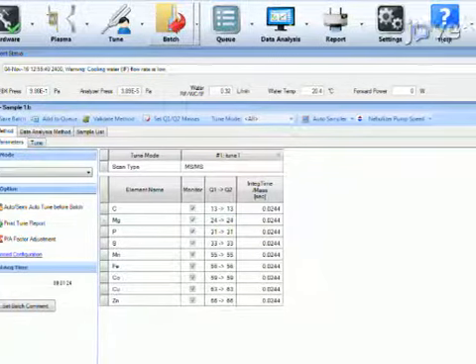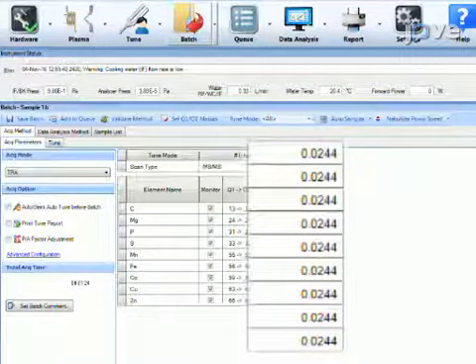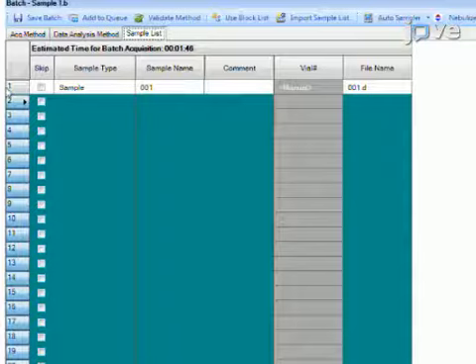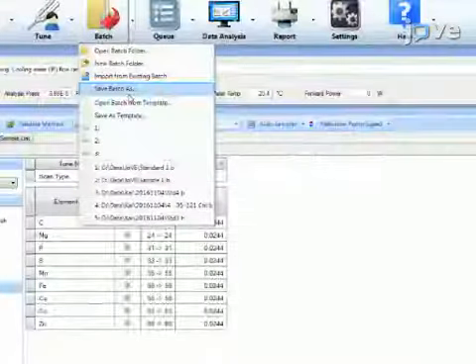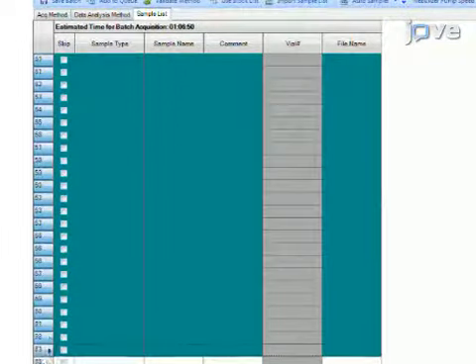For a standard batch, fill in the analysis time for each line with an additional 15-second buffer to account for laser warm-up and washout times. Set a sample run list with an acquisition for each standard line. For the sample batch, duplicate the standard batch and adjust the times and number of acquisitions accordingly for the sample ablation pattern.